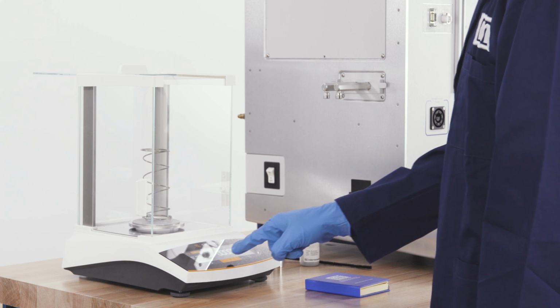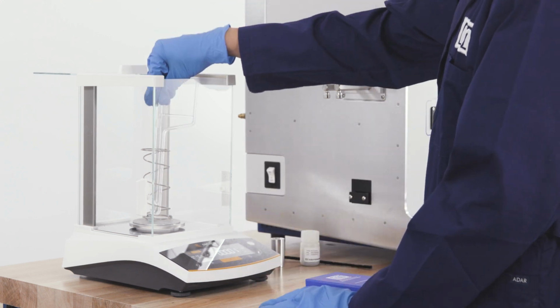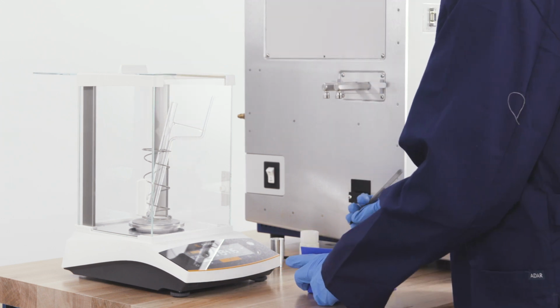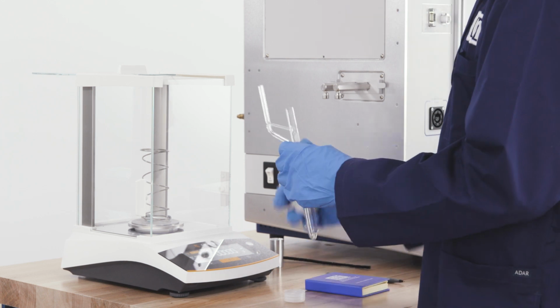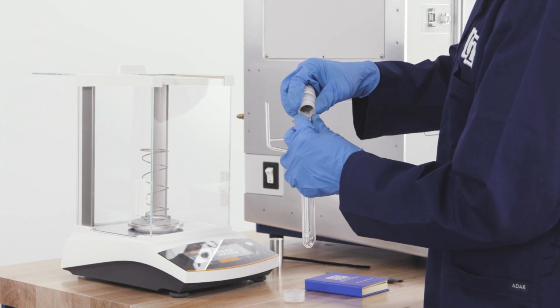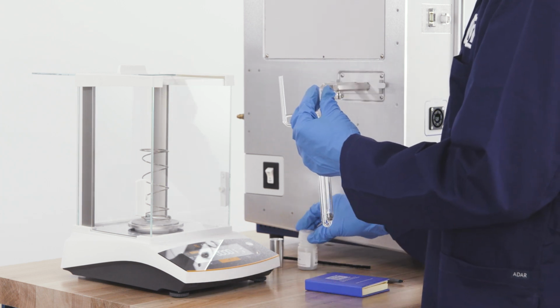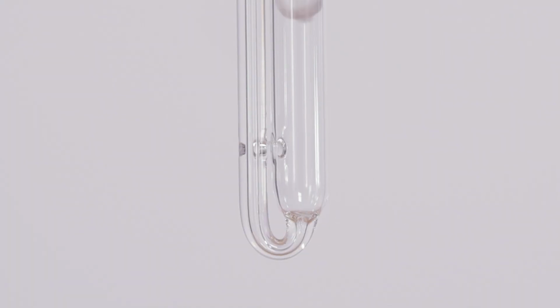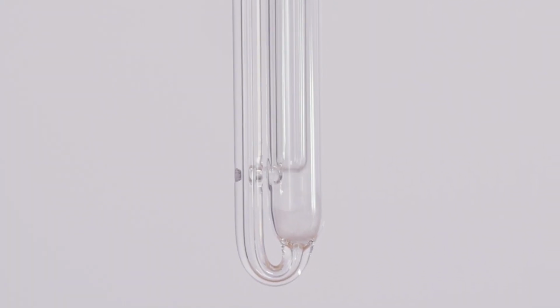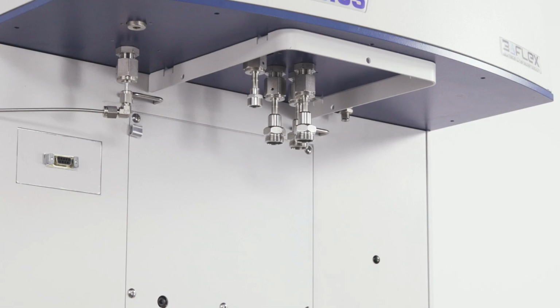Whether you are performing static or dynamic chemisorption analysis, the same sample tube will be used. First, take an empty chemisorption sample tube and weigh it, recording the empty tube mass. Next, load the sample into the sample tube using a funnel if necessary. Use a pipe cleaner to ensure that no particles are stuck to the side of the tube. Quartz wool can be added to the bottom of the sample column to ensure that sample is not sucked into the exhaust port. Record the filled sample tube mass.